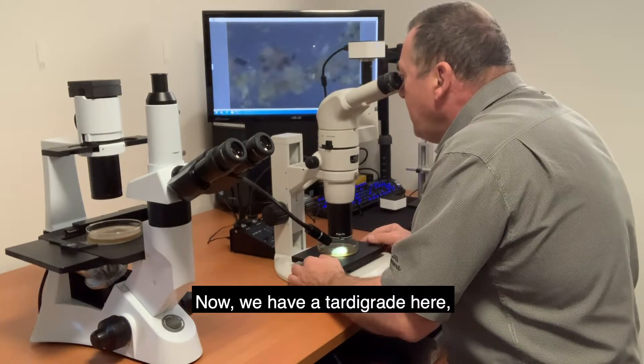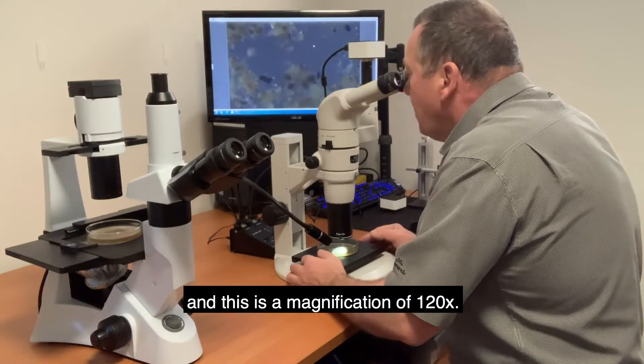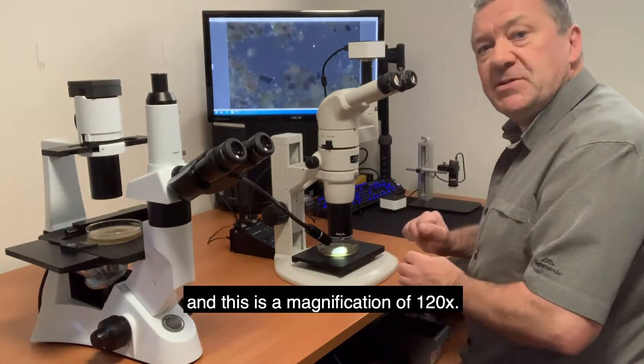We have a tardigrade here and this is at a magnification of 120 times.